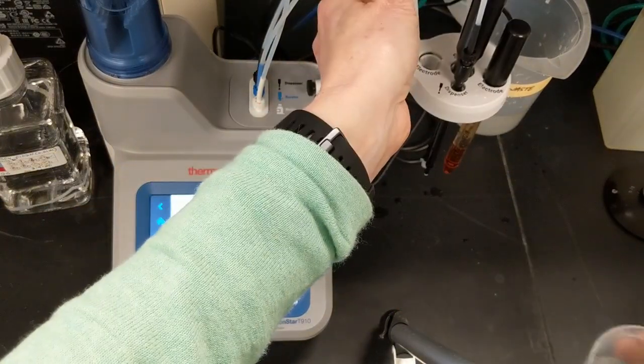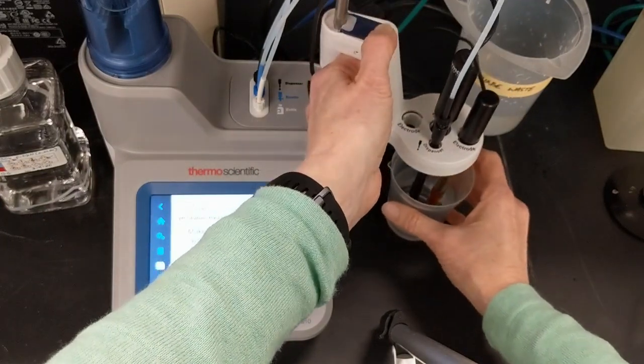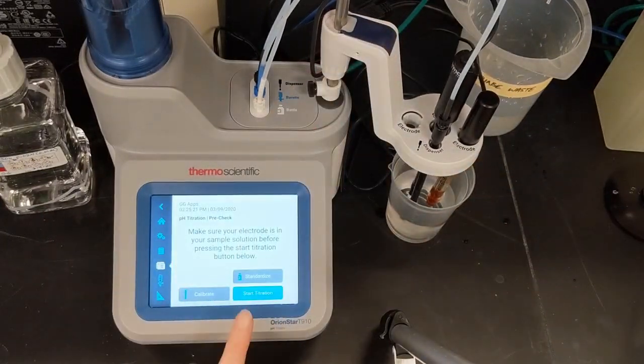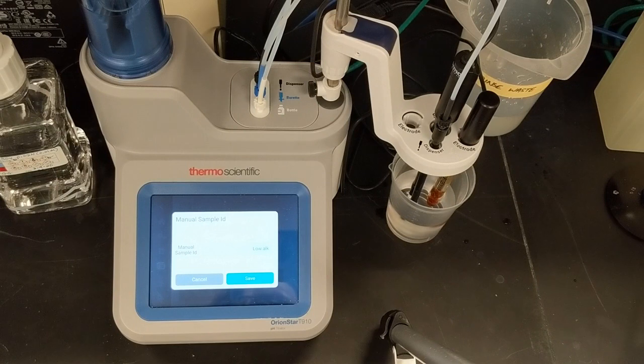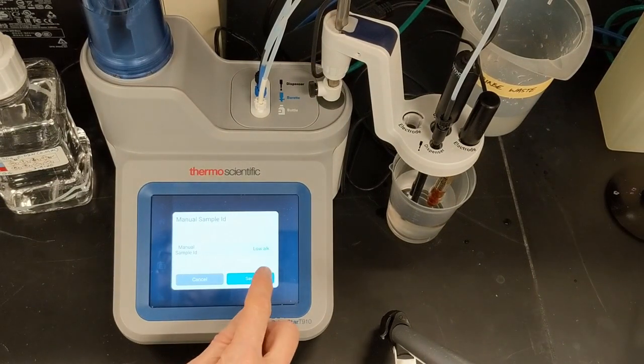I've already rinsed the electrode, stirrer, dispenser, and ATC, so I lower the holder into the solution and select Start Titration from the titration pre-check screen.